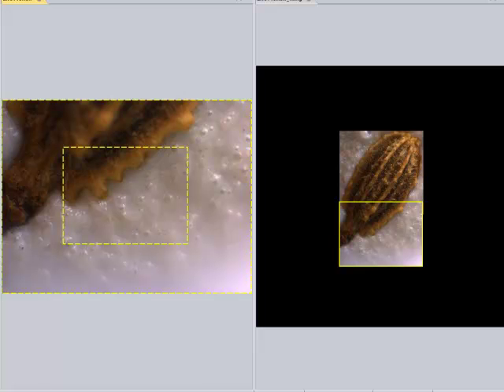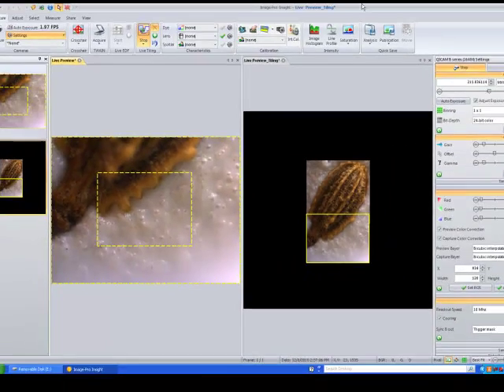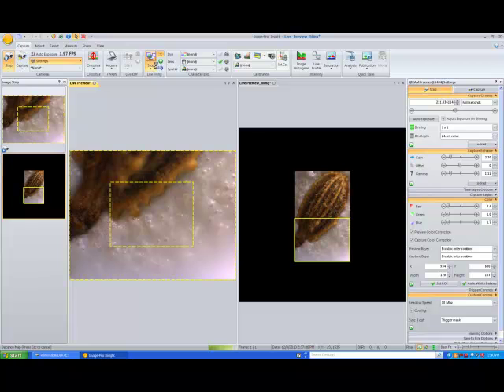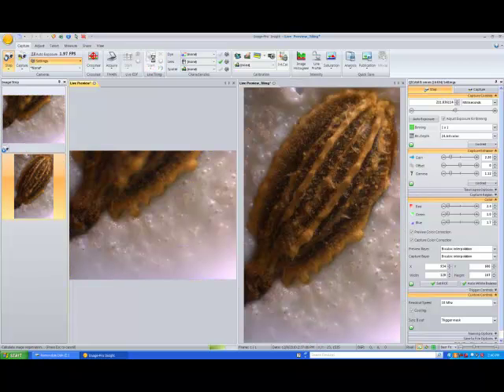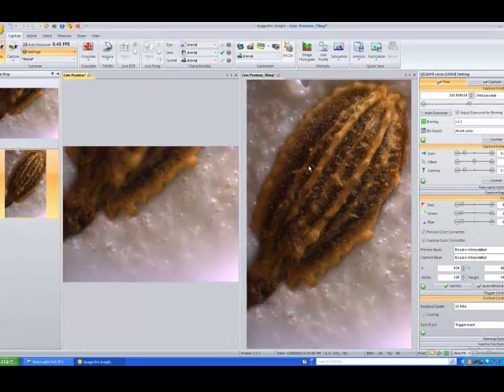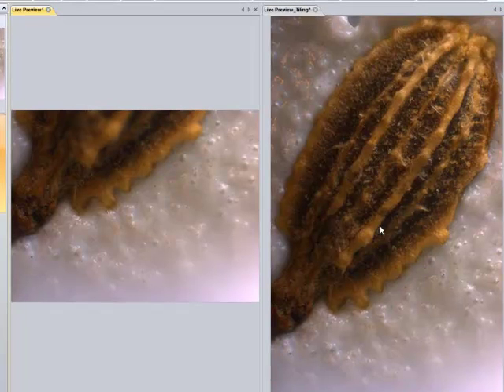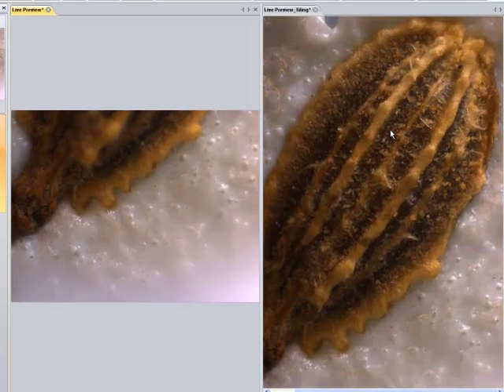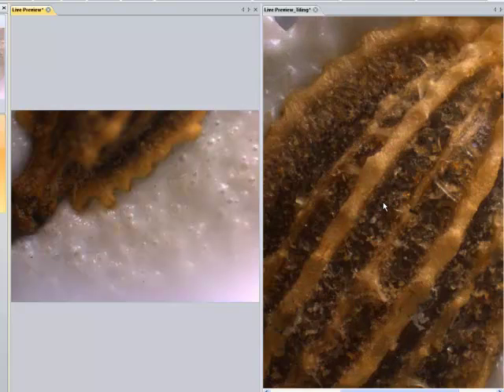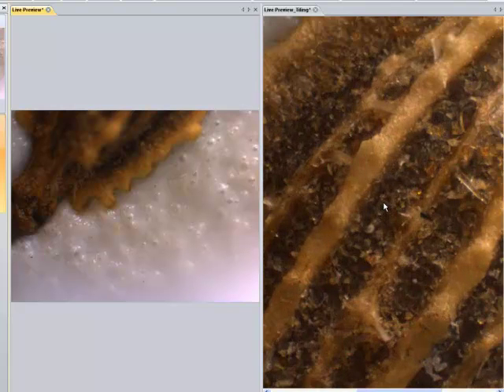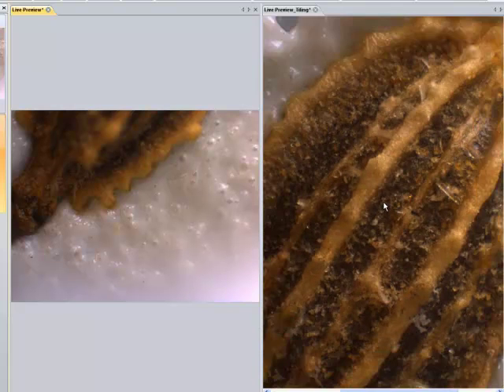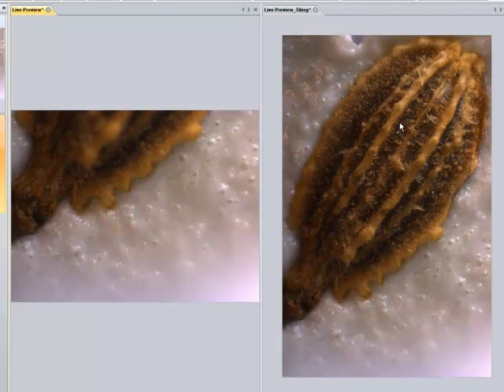And now, once I'm done, I just simply stop tiling. And here I have fully in focus virtually the entire seed of our cucumber seed using the combination of live tiling and live EDF all combined together.